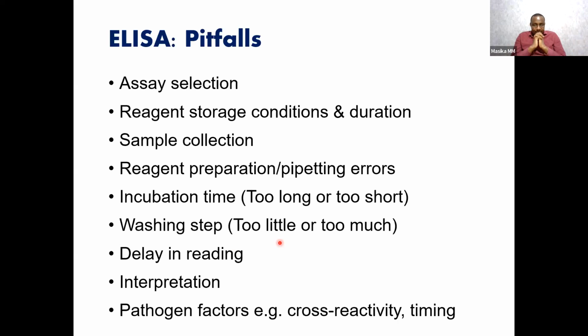What do you do? That happened to me once, by the way. You have to test the reader before you start the PCR or the ELISA. Test it, make sure it's working. Don't assume that because you used it yesterday, today it's still working, because you can imagine this decays.